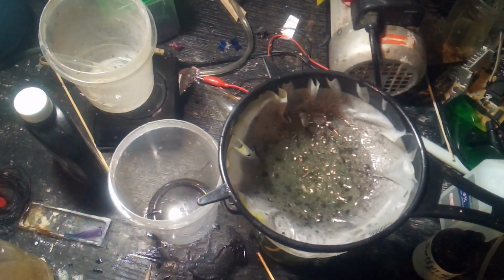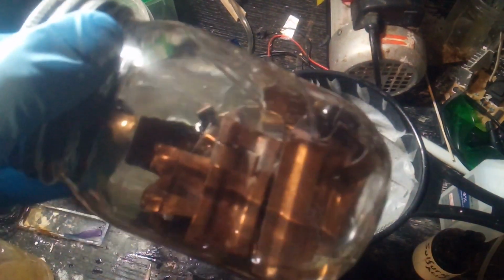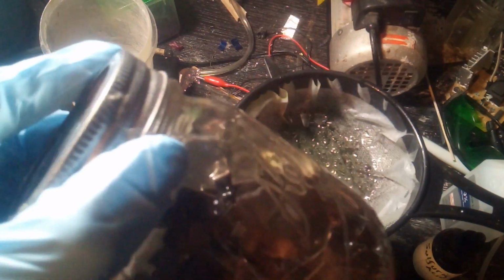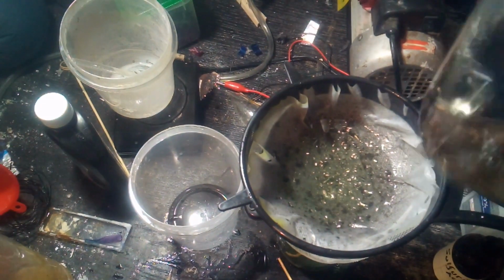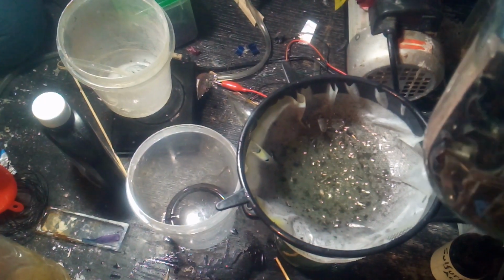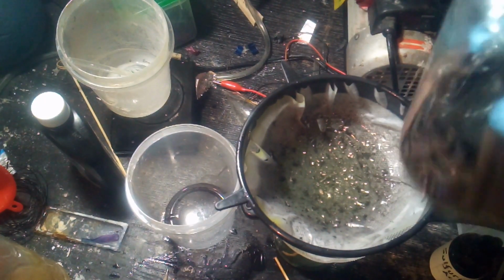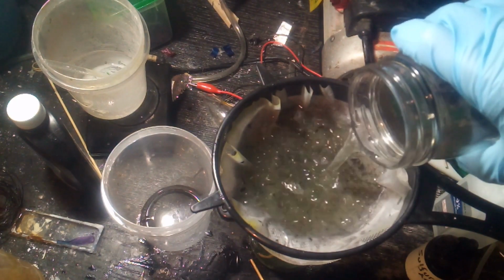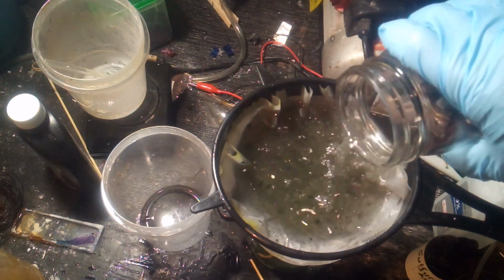So we're almost at the end of the road with the chromium extraction because I made a mistake. I drained my hydrochloric acid into a container that already had water in it. So my acid is now dilute. It's probably not going to attack the chromium much, or the base metal under the chromium much anymore. So I'm giving this one last good shake, draining any more chromium flakes into my filter.